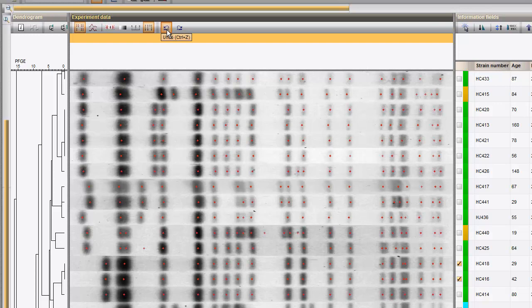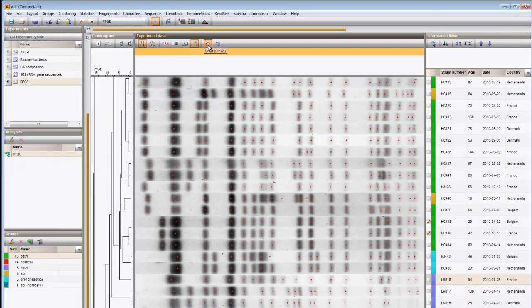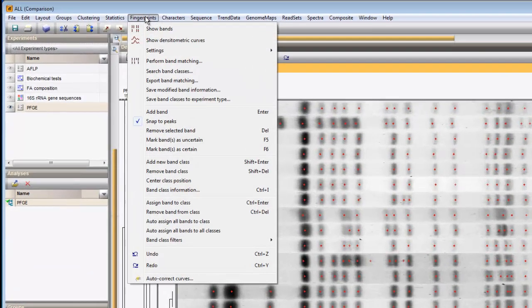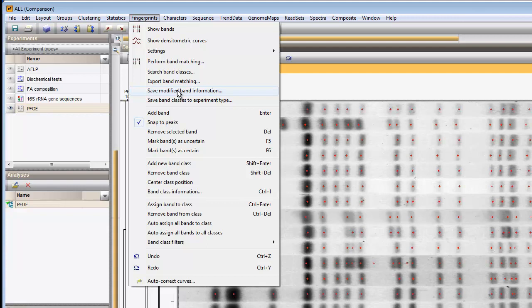Band editings within the comparison are not automatically saved when the comparison is saved. To save the modified band information, there is a separate Save action. Fingerprints, Save modified band information.